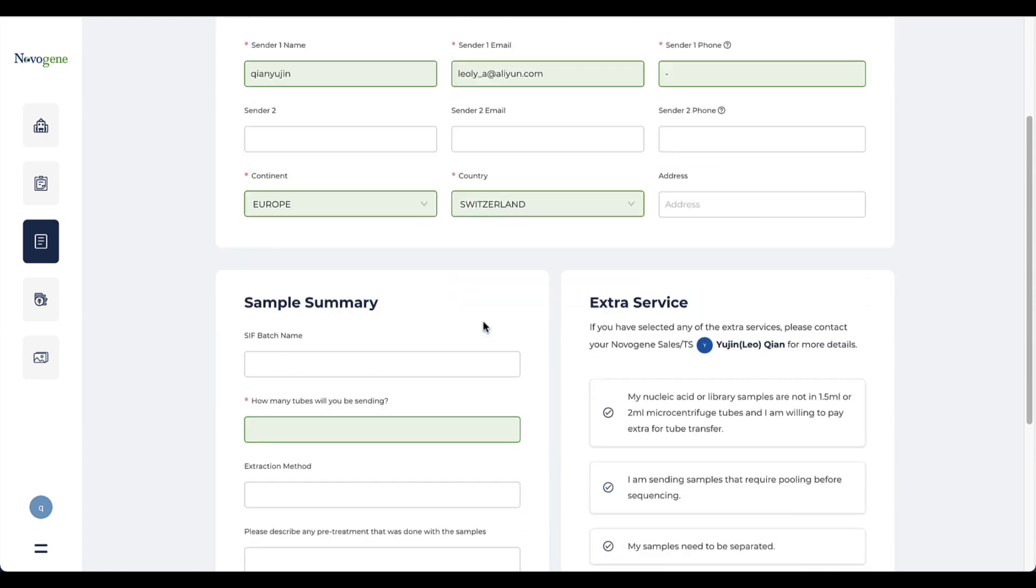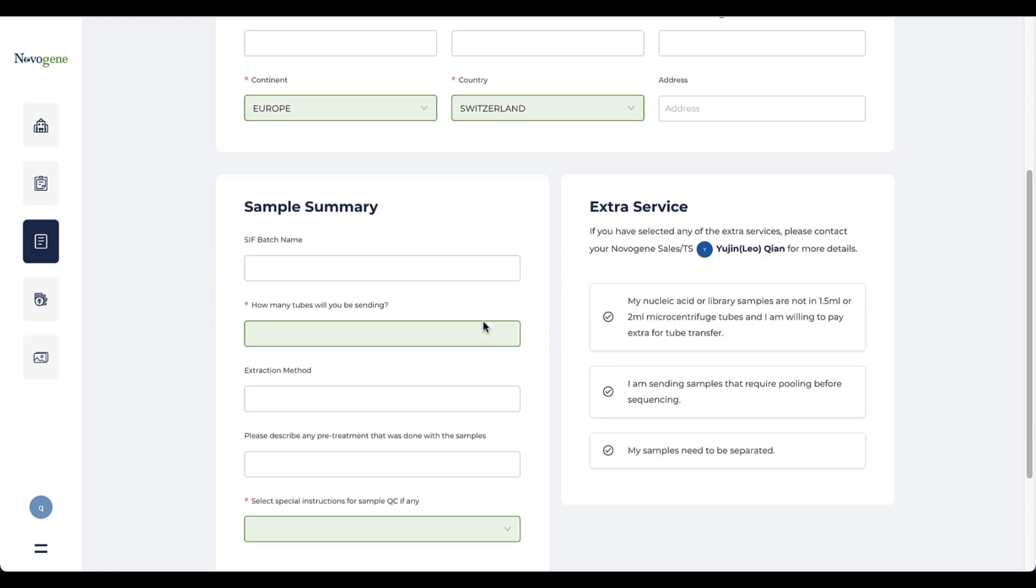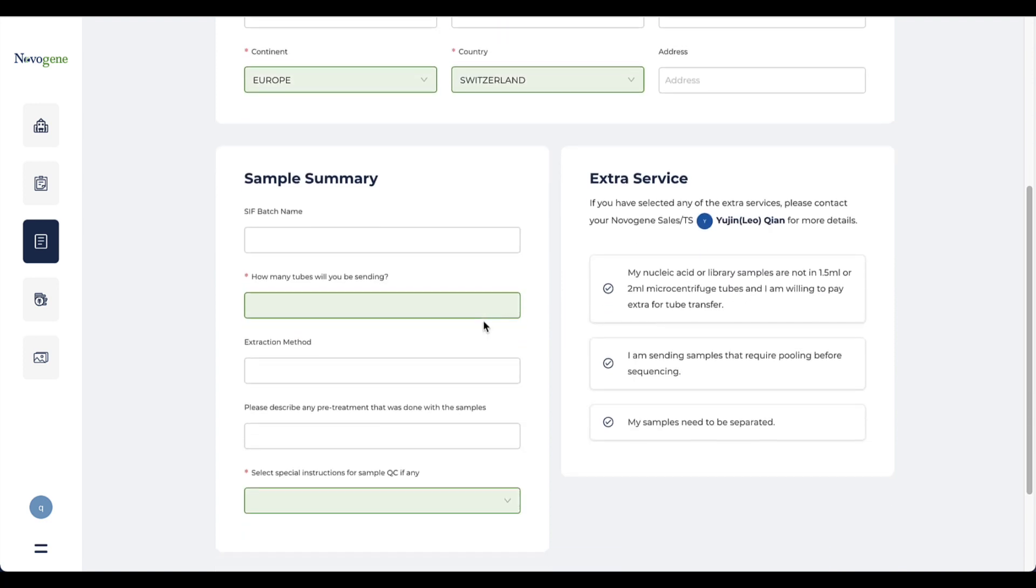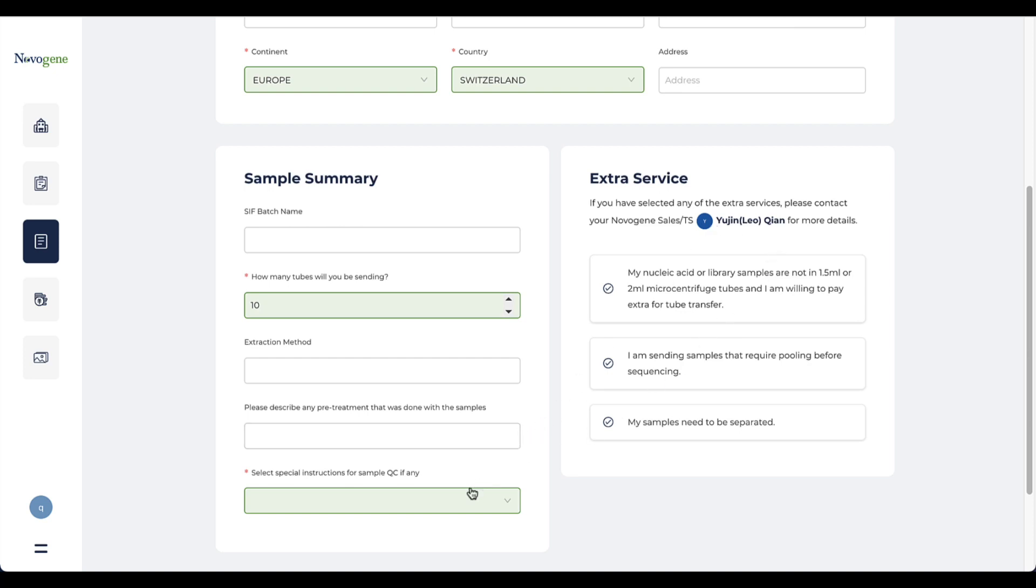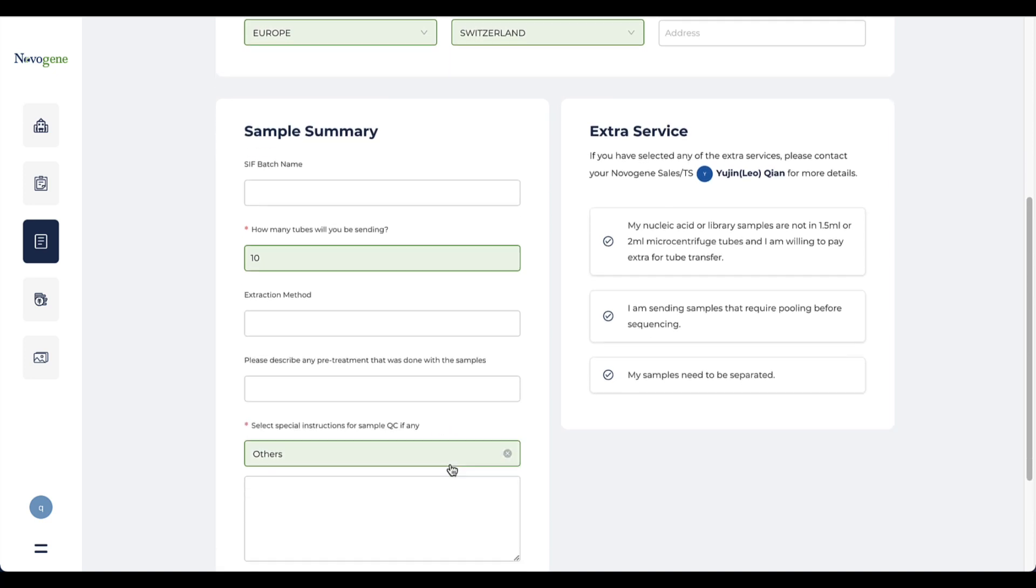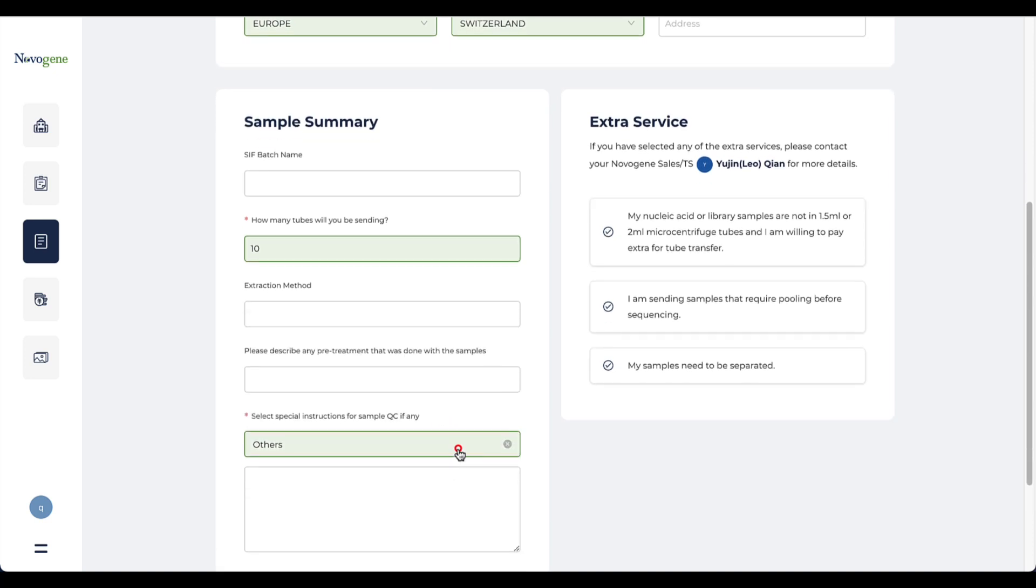The sample summary part requires some basic information of sample batches you would like to send to us. Please note if your samples are not packaged in 1.5 milliliter or 2 milliliter tubes, a tube transfer fee may apply. Please contact the technical support listed here for more details. We will arrange the library QC once the sample is received by our lab directly with our standard QC process. Please select others and specify requirements if you have any.